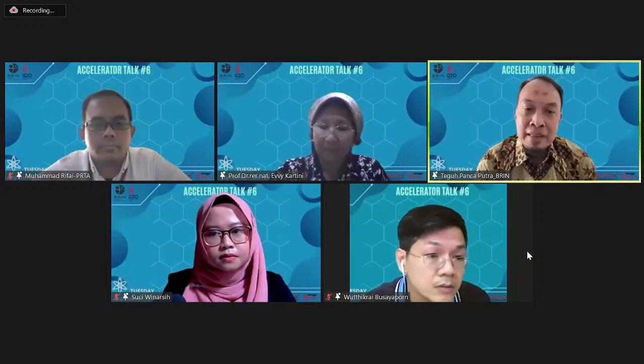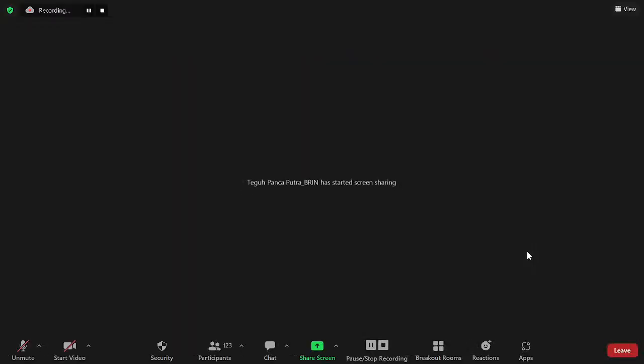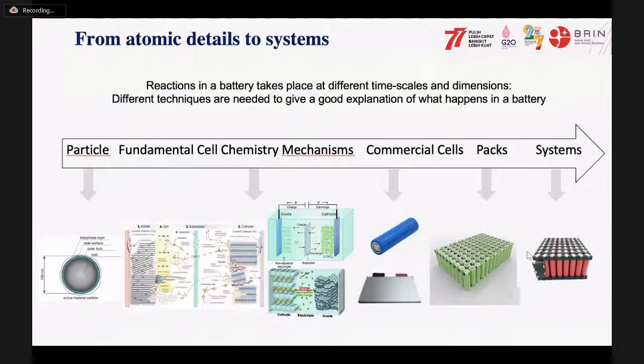So in this case, I would like to share some of my work related to batteries. Actually, I have similar work to Professor Evi, and mostly I use XRD and also neutron. I will pass some of the slides, but what I want to say is that we can work on many different parts of the battery.